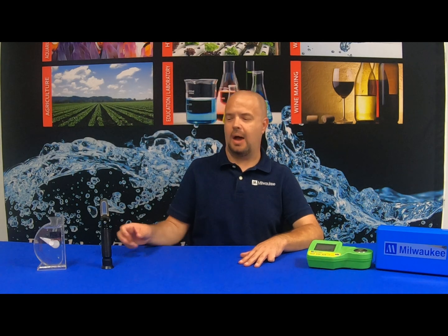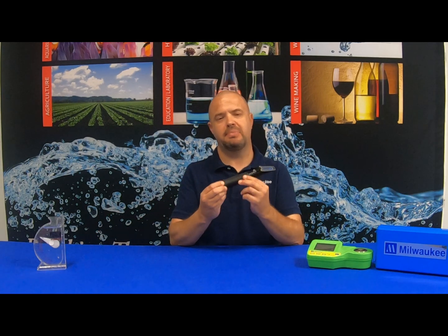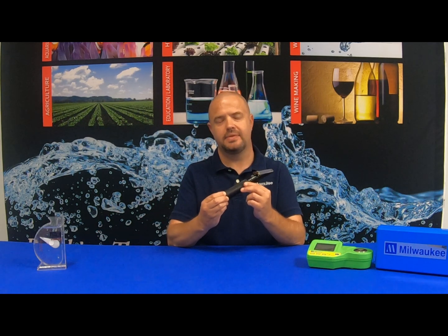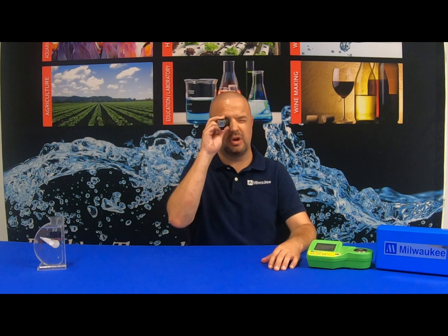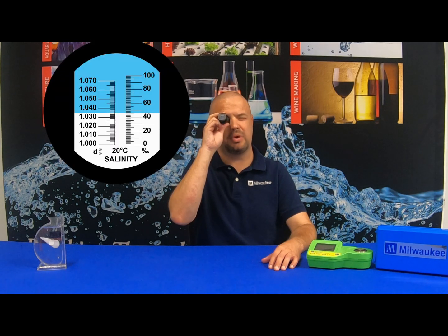When using the optical refractometer, it's best used in sunlight, as fluorescent lighting can alter your readings. Also, it can be difficult to separate the lines when looking inside the optical refractometer.